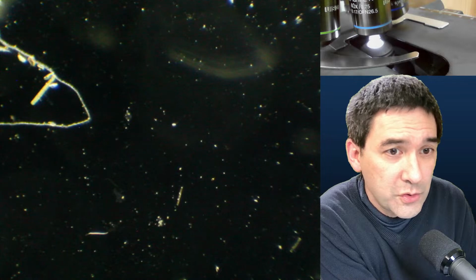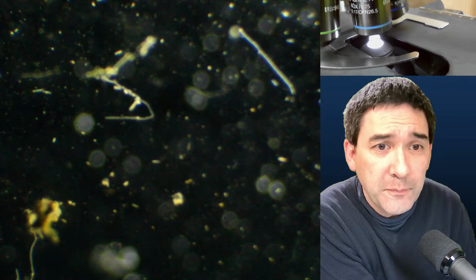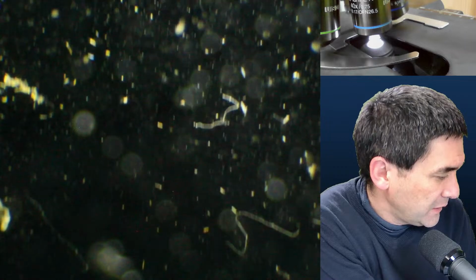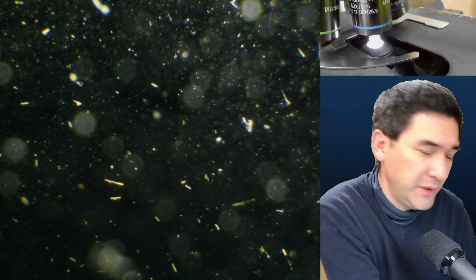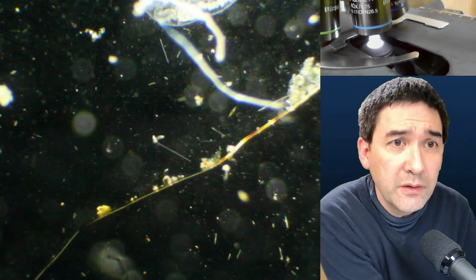It's now just a question of finding it. Maybe at a lower magnification, because some of the cover glass has already dried out. Let me quickly check. I'll take it out again and see where the sample is. Oh, it's over there in the other corner. Okay. So over here.